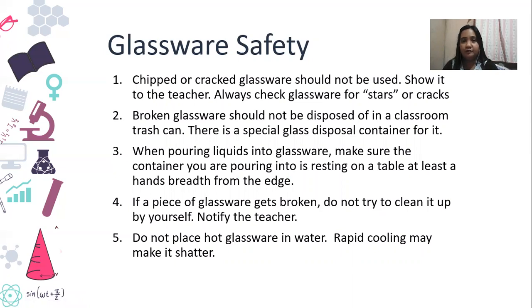Broken glassware should not be disposed of in a classroom trash can. Yes, please remember that. We have a special trash bin or disposal container for broken glass. When pouring liquids into glassware, make sure the container you are pouring into is resting on a table, at least a hand's breadth from the edge.